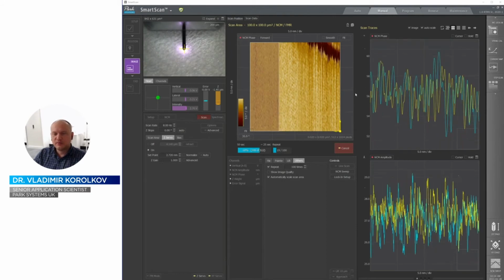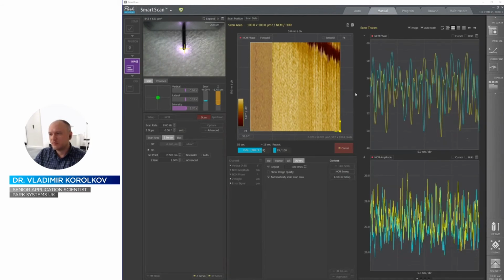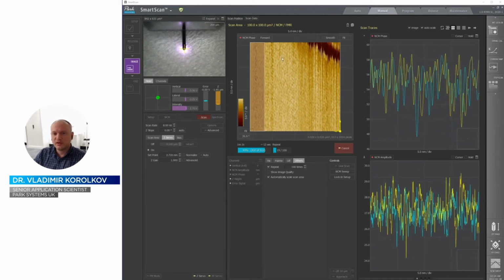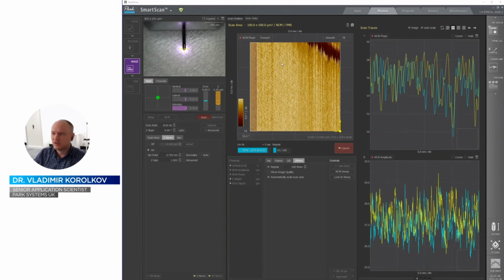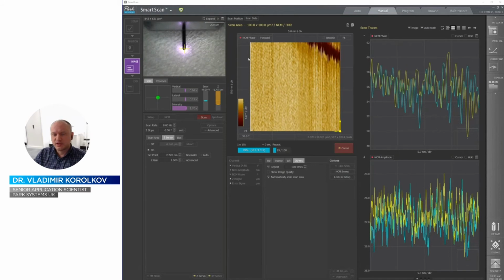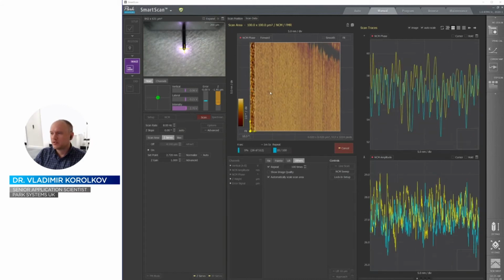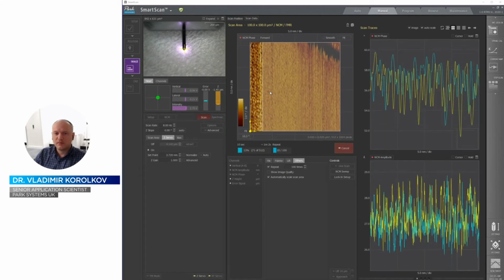Okay, so here's an example. We're sitting right on top of the Teflon lamellae. I will explain a bit more what exactly we're seeing in the slides, but that's a typical phase image. I deliberately didn't optimize the imaging conditions, so it's like your average high resolution phase image. In this instance, it's a 20 by 20 nanometer scan, and you can see lines running along the image. Those lines are separated by 5.6 angstroms, and these are individual single Teflon chains.